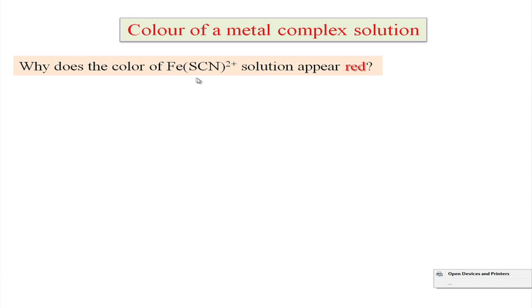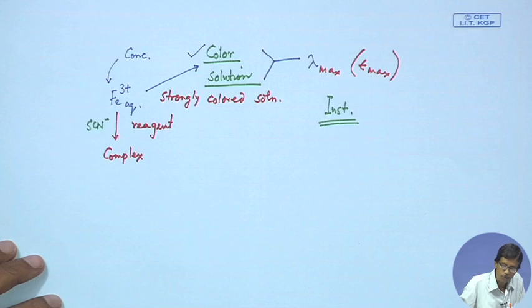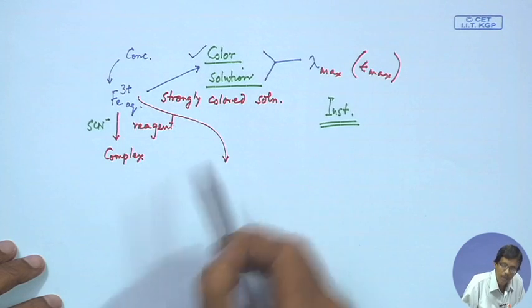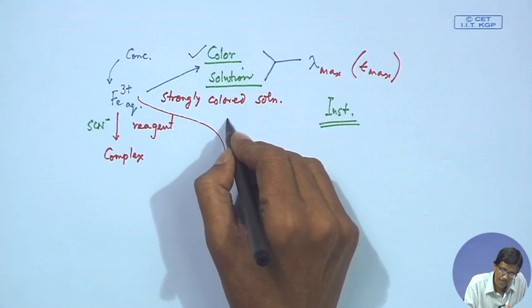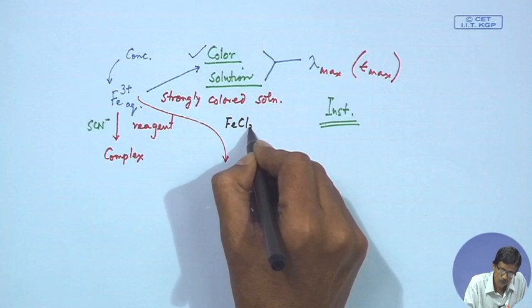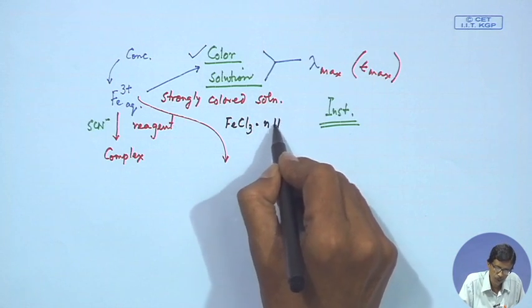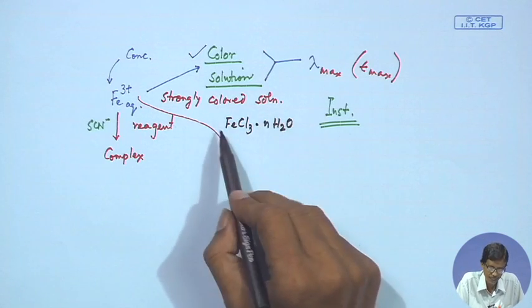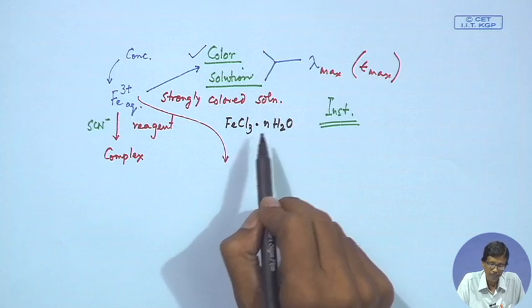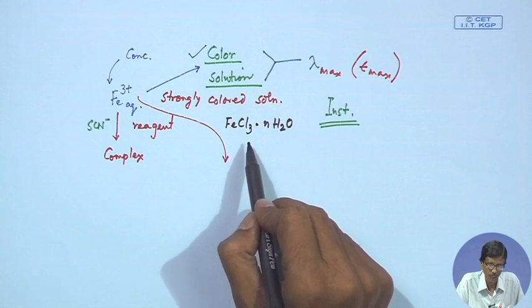It is the first species forming in the solution from the reaction of Fe3+ with SCN minus. So, this aquated species, as we all know, how do we get that? We know the salt which is available in the laboratory has some n number of water molecules in it, that means water of crystallization, which you do not have to bother about, but when you quantify how much iron we are dissolving, we take the weight of ferric chloride in a solution which is slightly acidic with hydrochloric acid.